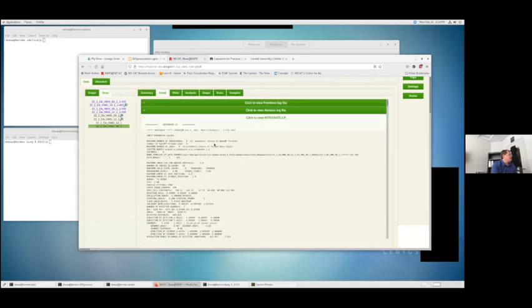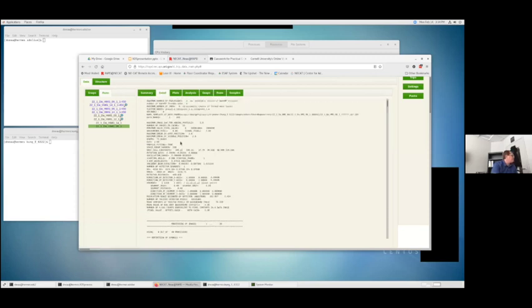If I click on that, I'm looking for ORGX and ORGY, which are the values that you're using. So that's origin X and origin Y. That's essentially the X and Y coordinates of the direct beam of the experiment.